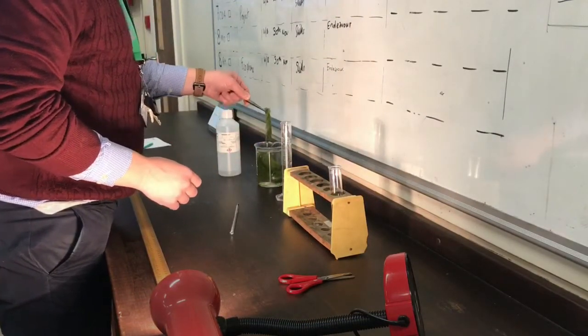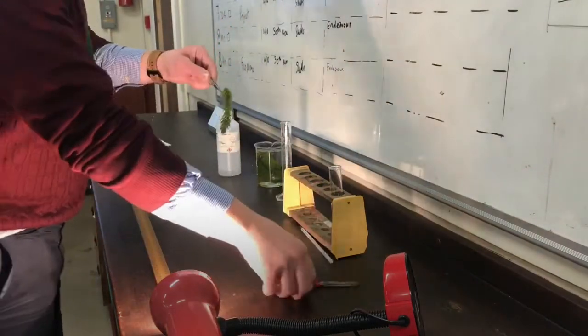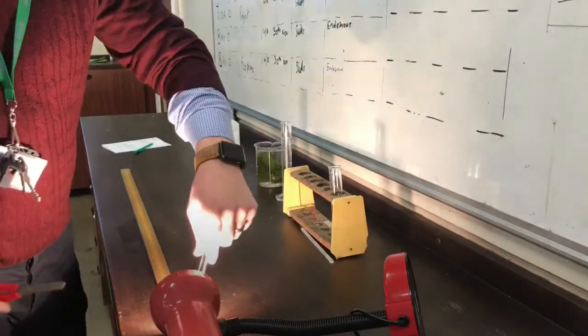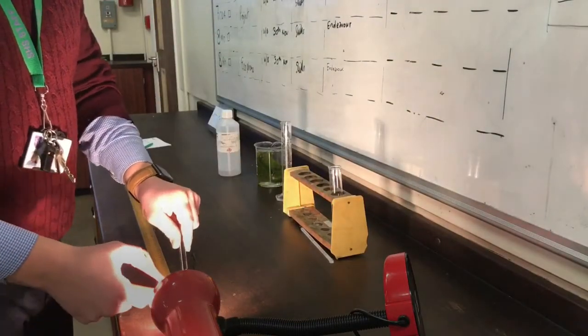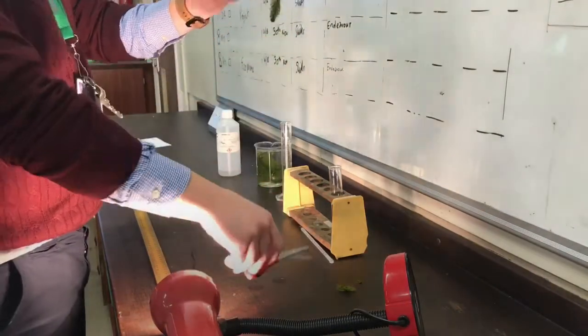You'll notice I'm preparing the plant ready for testing. I'm going to be measuring it out and snipping the end off at an angle.